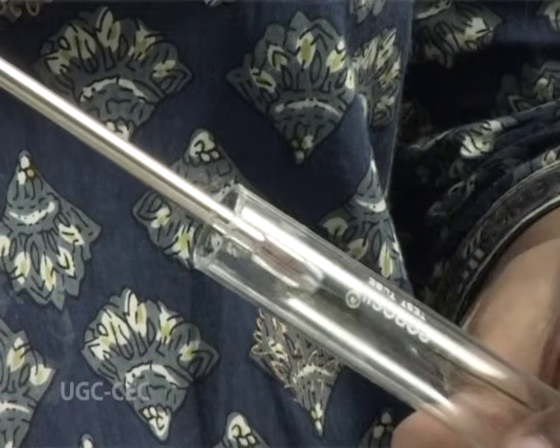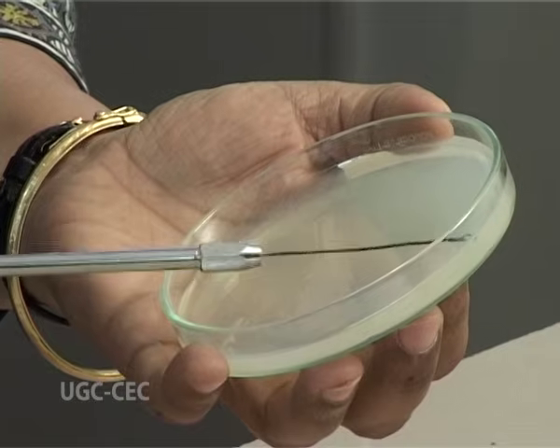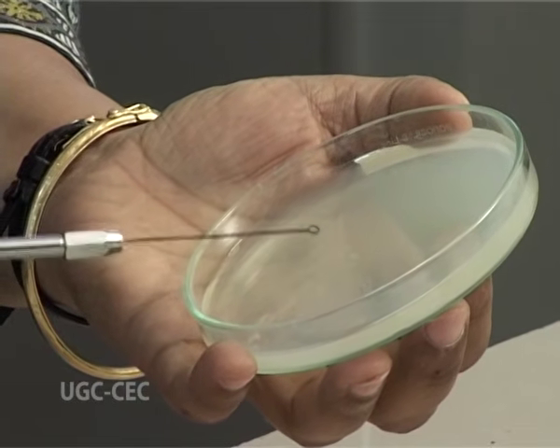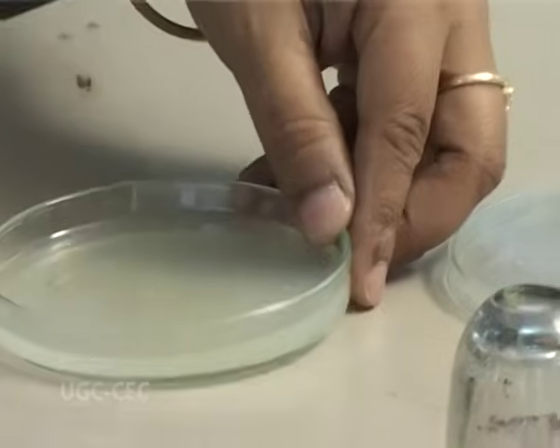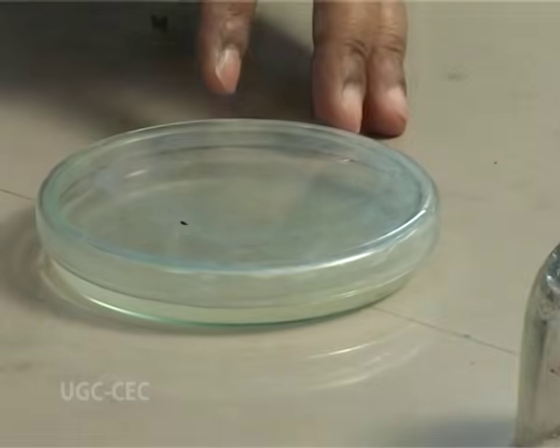You have the loop with the bacterial film, and you start streaking from the top of the Petri plate in this direction. You do not take out the needle; you keep on streaking the plate in one direction only, directly taking the inoculum and continuously putting the streak onto the surface of the solid media.